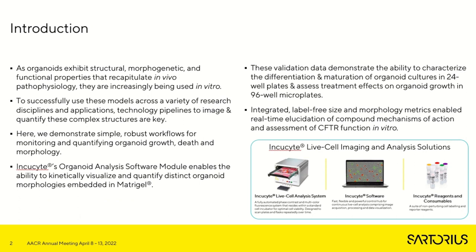Since organoids display structural, morphogenic and functional properties that recapitulate in vivo physiology and pathophysiology, they are increasingly being used in vitro to model organogenesis and offer platforms for drug discovery, disease modeling, personalized and regenerative medicine. To use these models across a range of such research areas, technologies used to not only image but also quantify phenotypic responses in these complex 3D structures are key.